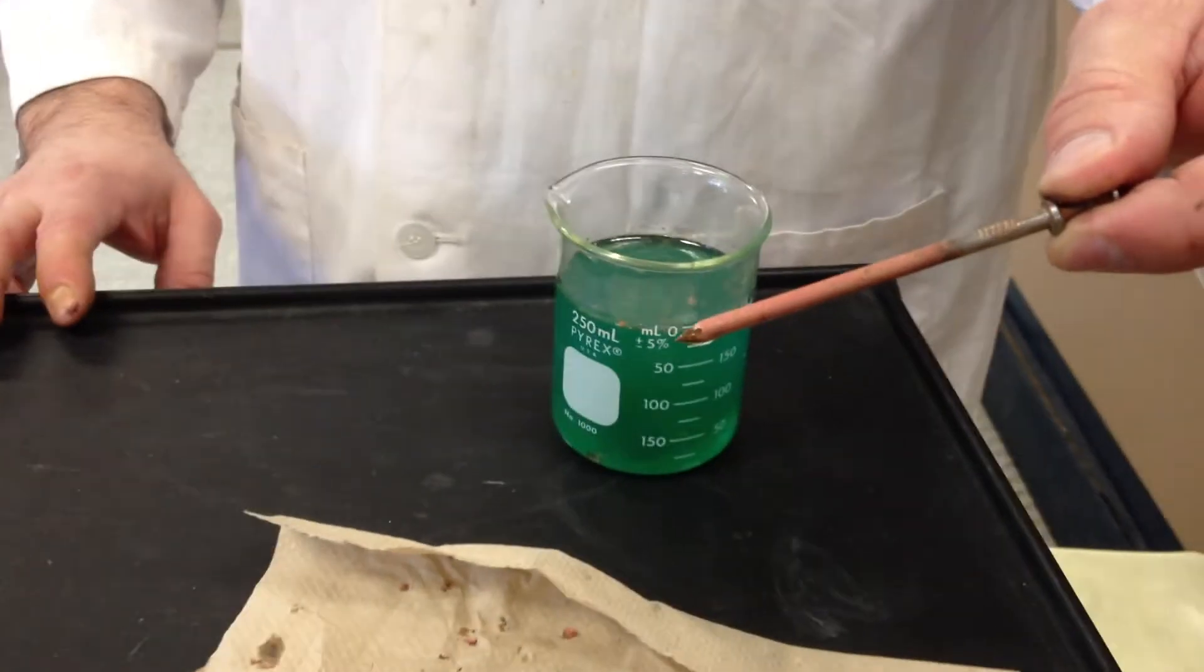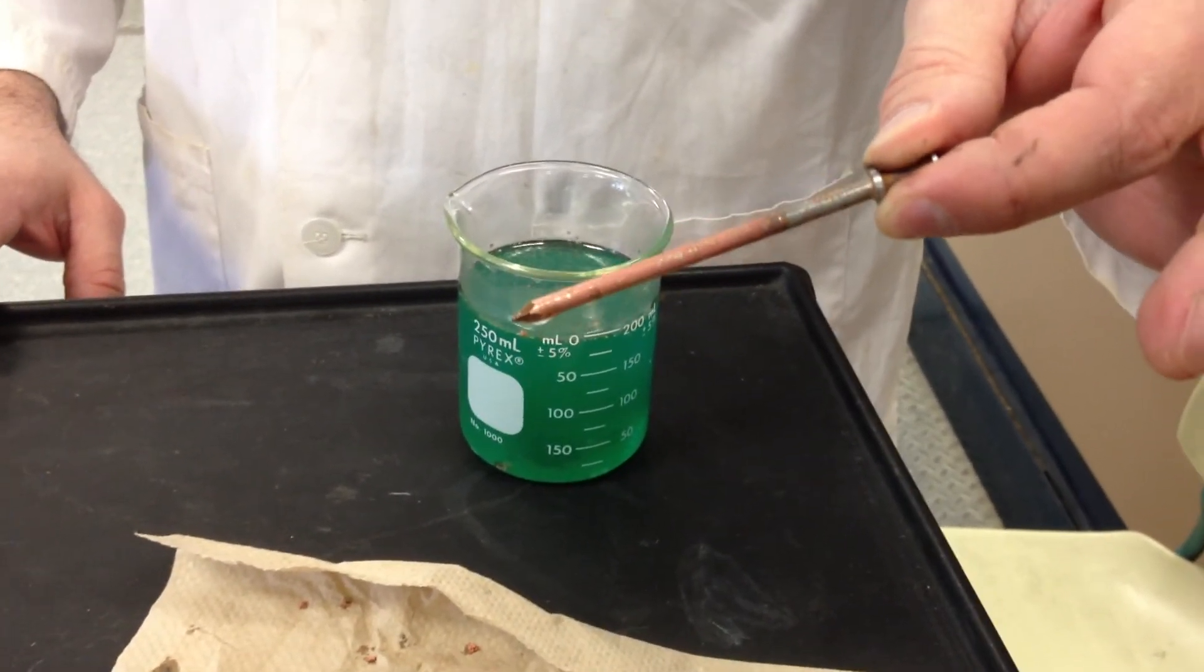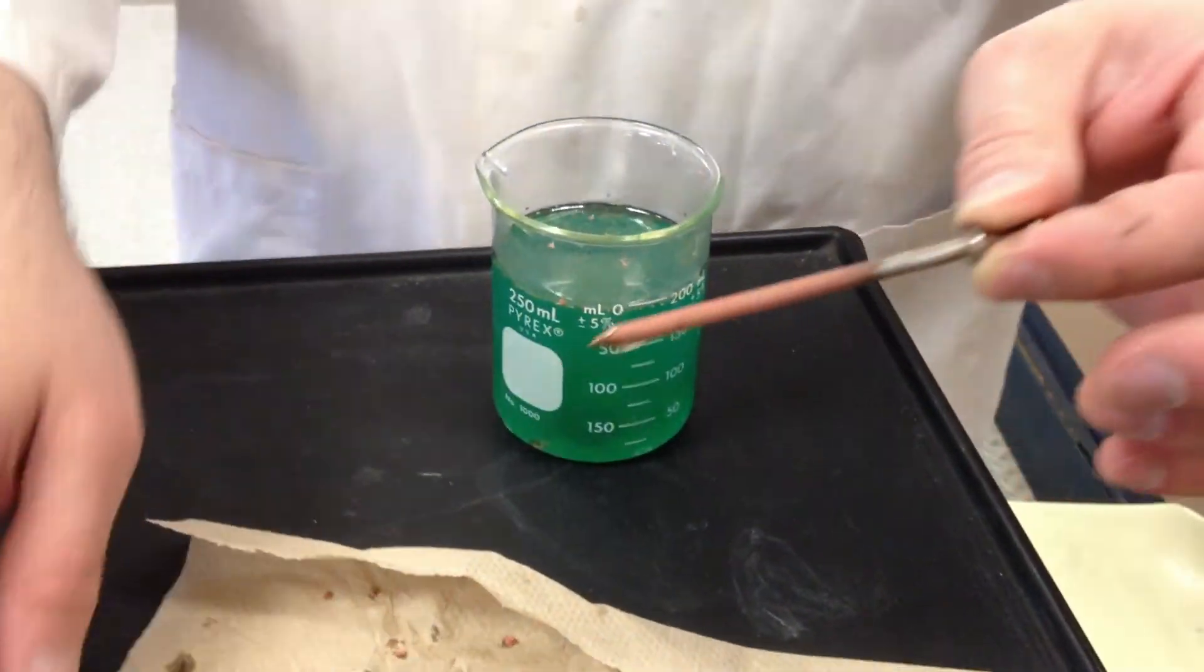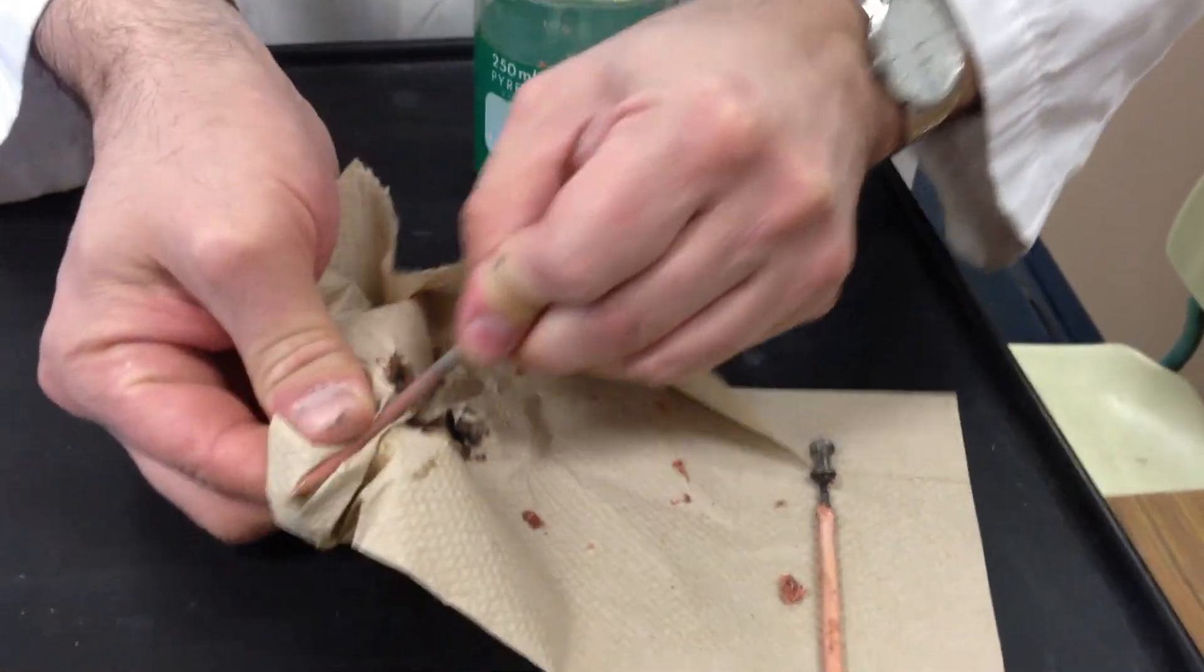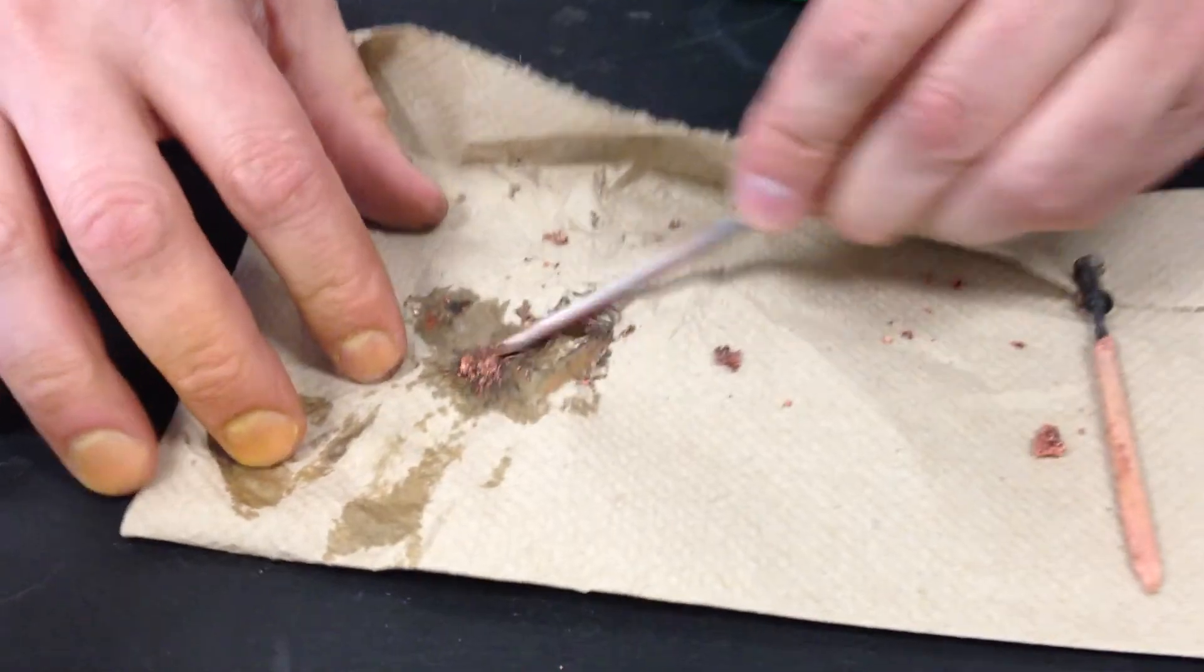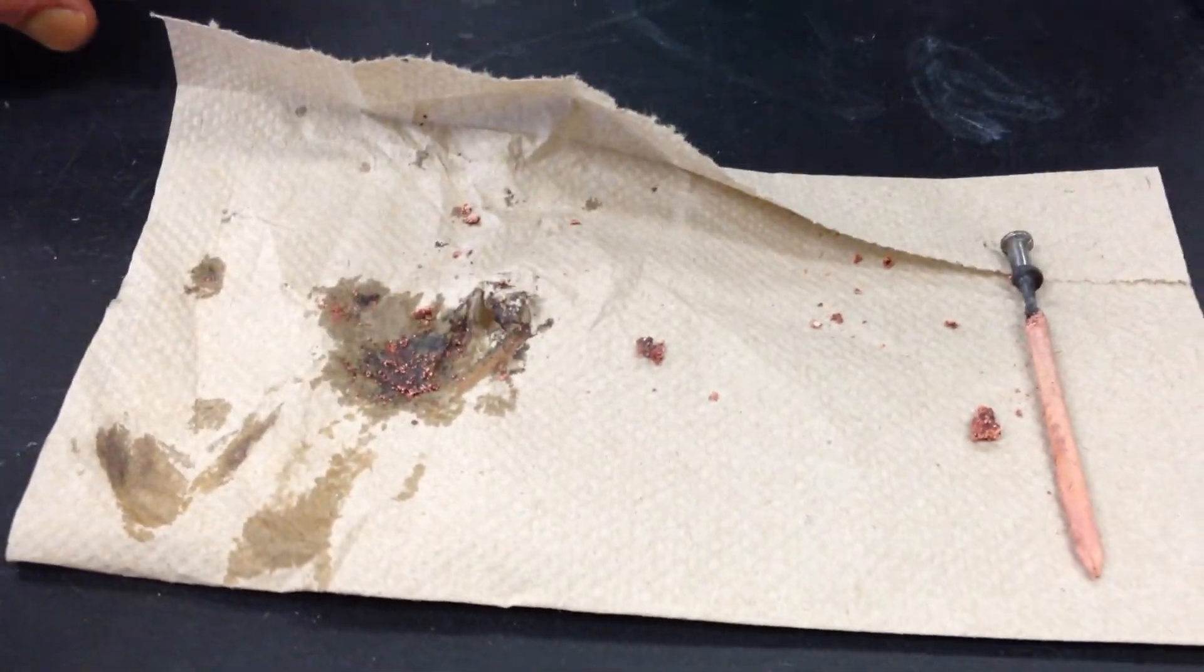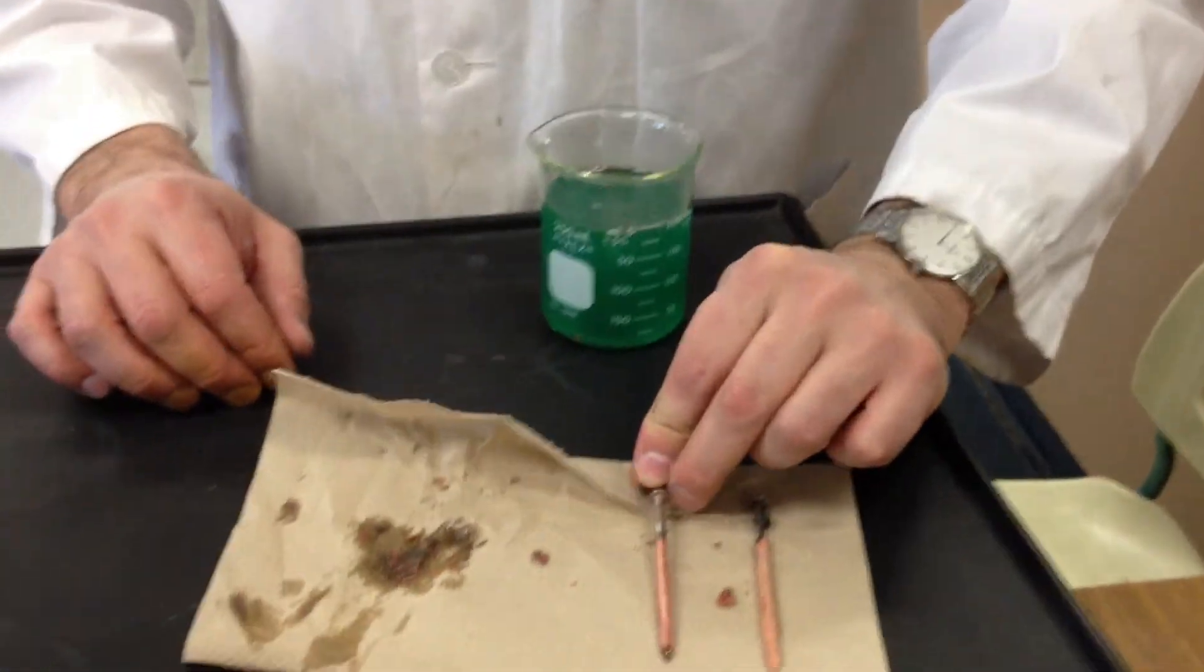So clearly iron is higher on the activity series than copper. It'll force the copper to take the electrons and it'll reduce onto the surface of the nail. This doesn't adhere quite as well - I guess it hasn't had the time. So you can wipe it off, but you see metallic copper on the napkin. There it is again.